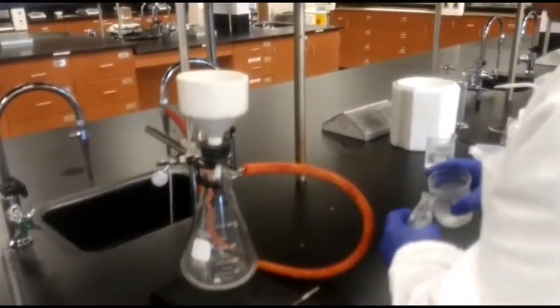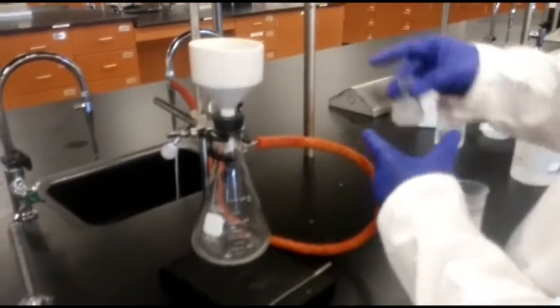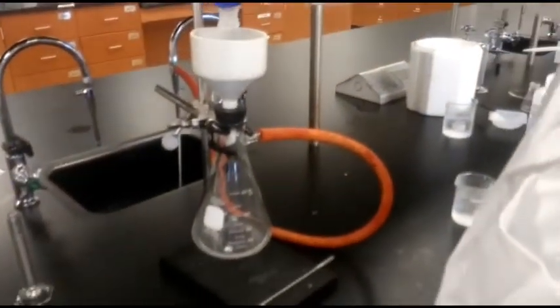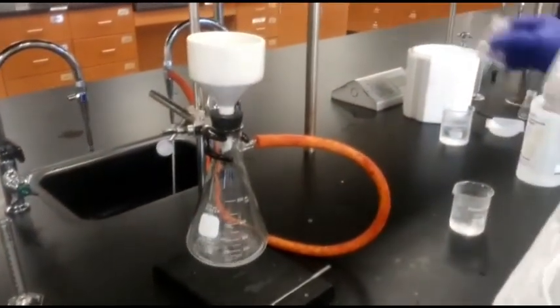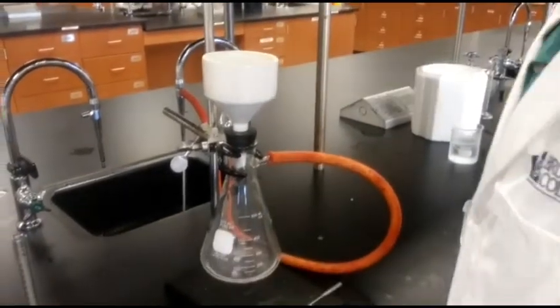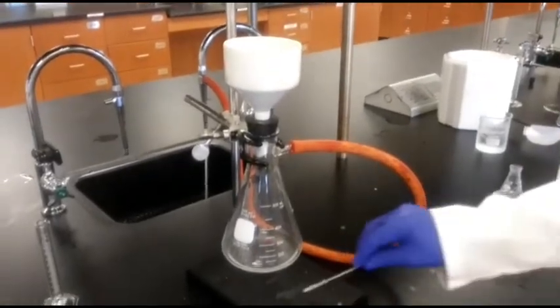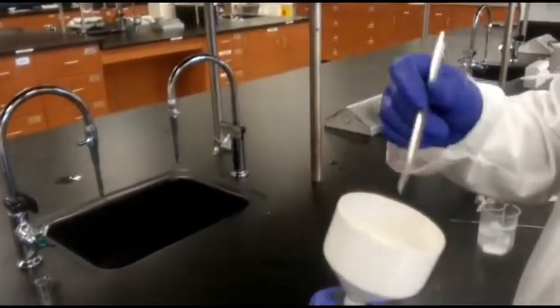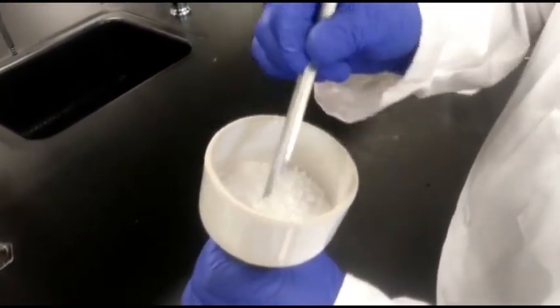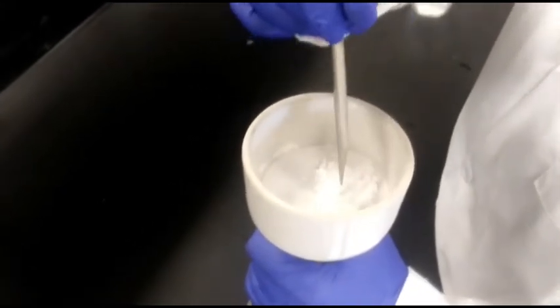Then a little bit of ice cold water to rinse our product. Right. Okay, here we have a very good amount of dry sample of acetylsalicylic acid. It is very crystalline also. It's like very shiny crystals you can see there.